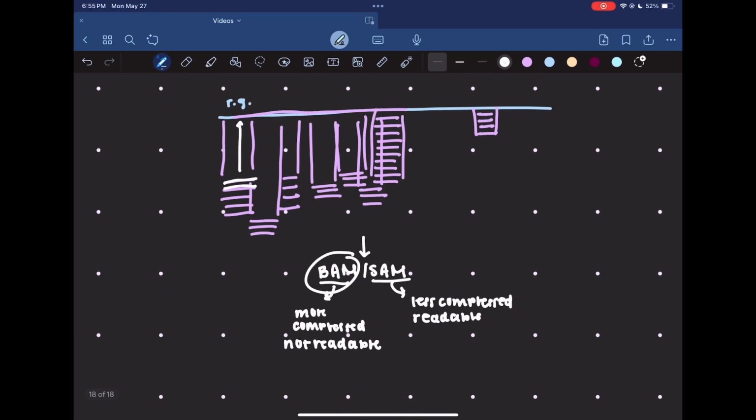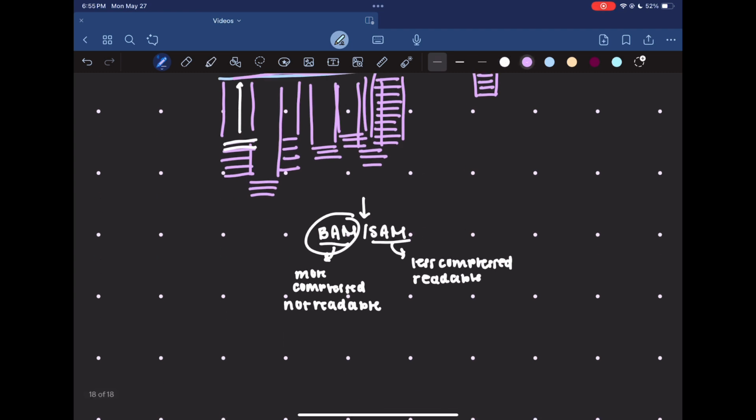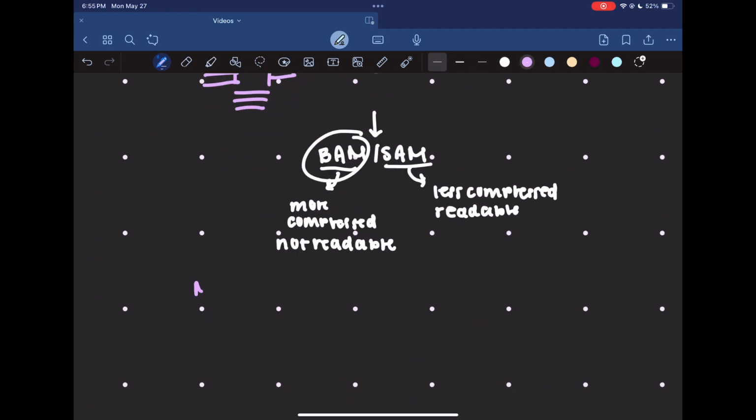And this is a little different format than FASTA. It has quite a bit more information, but the main thing that I would focus on from this is called the MAPQ score. And the MAPQ score is essentially very similar to a Phred score, but instead of pertaining to individual base pairs and the confidence of their read, it indicates the confidence of a match or an alignment.